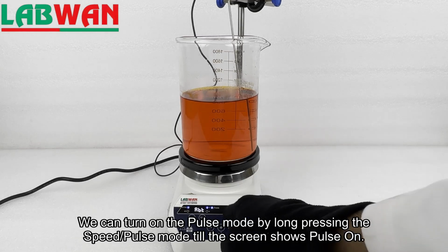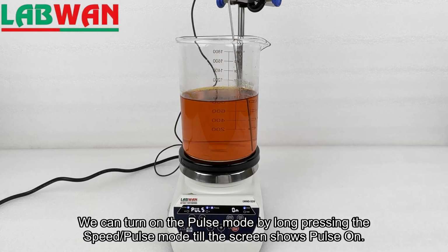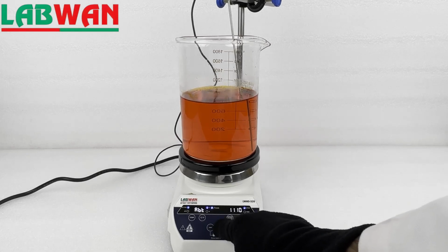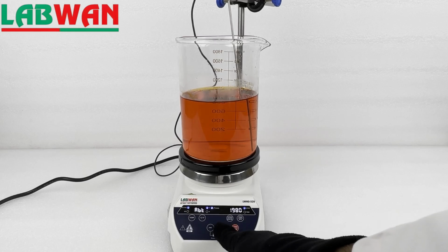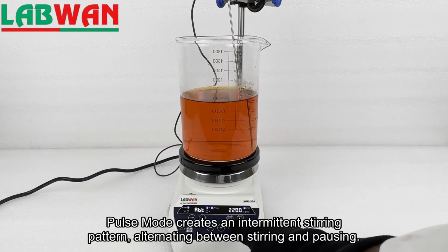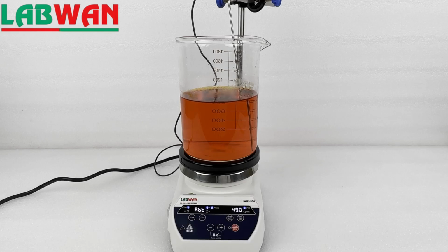We can turn on the pulse mode by long pressing the speed, pulse mode till the screen shows pulse on. Pulse mode creates an intermittent stirring pattern, alternating between stirring and pausing.